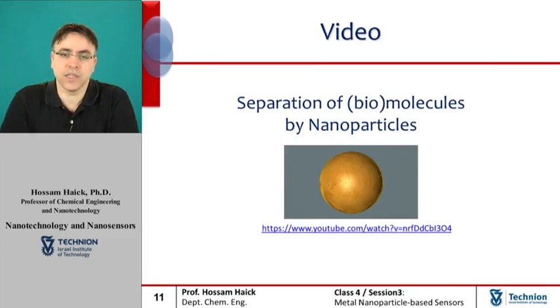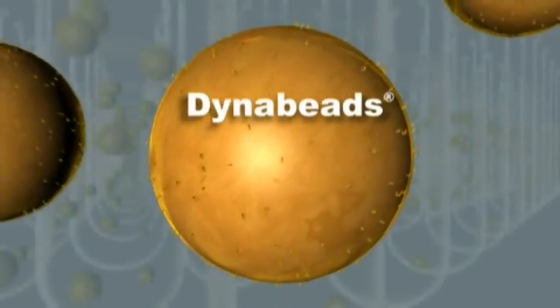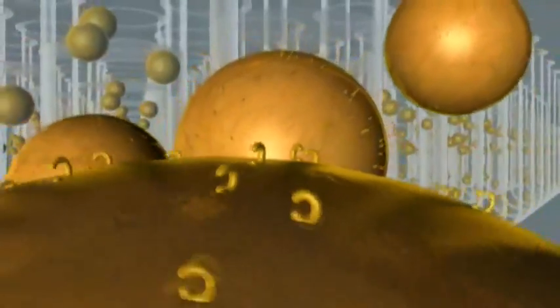To demonstrate the sensing process that relies on magnetic nanoparticles, I present here a short video that is taken from the following link. The general concept of this video is that separation of molecules and afterwards sensing can be done by magnetic nanoparticles. The solution contains many molecules, and this system is a sorting system that can select and separate a target molecule.